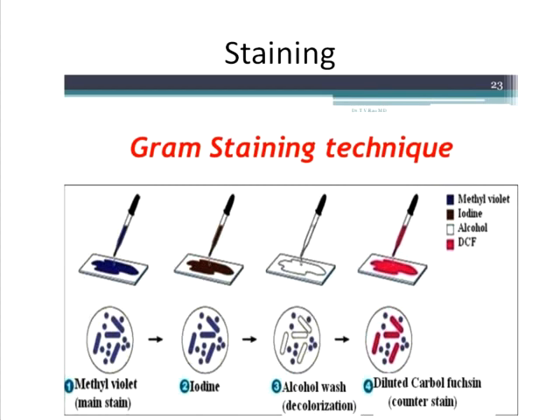The next step is like an eraser. That is, we are using alcohol or acetone. That depends from lab to lab, it varies. Now this is an eraser-like step, a rubber-like step, wherein when you use this decolorizing agent, some organisms let go of the stain and get decolorized or become colorless.